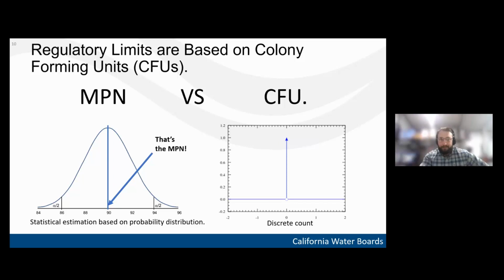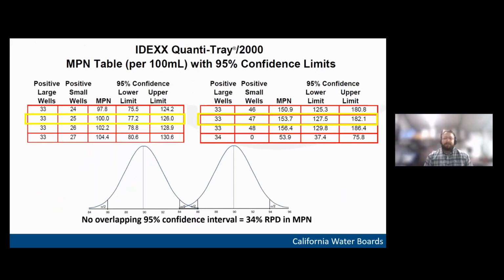So the first thing we entertained was that, well, we can just look at it based on our statistical evaluation. So if the confidence intervals don't overlap, then they are separate, and that's not good enough. The laboratory duplicates are then not precise enough. The problem with that is there's a lot of gray area, and that's not a very good metric for precision.